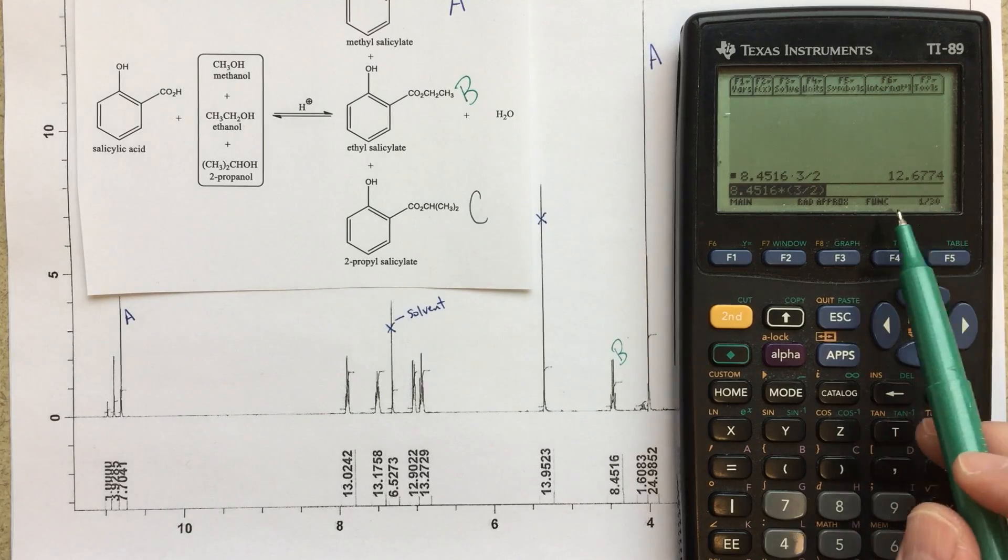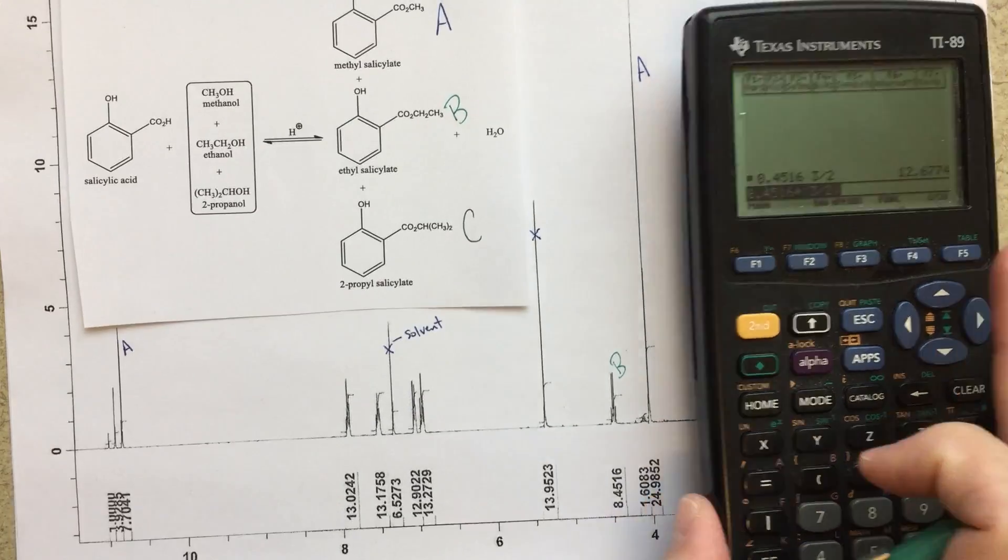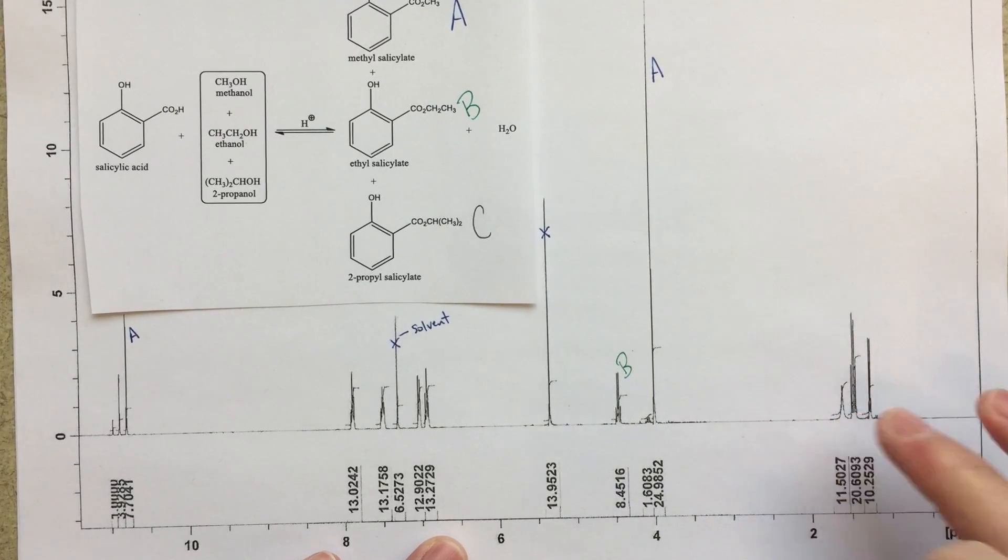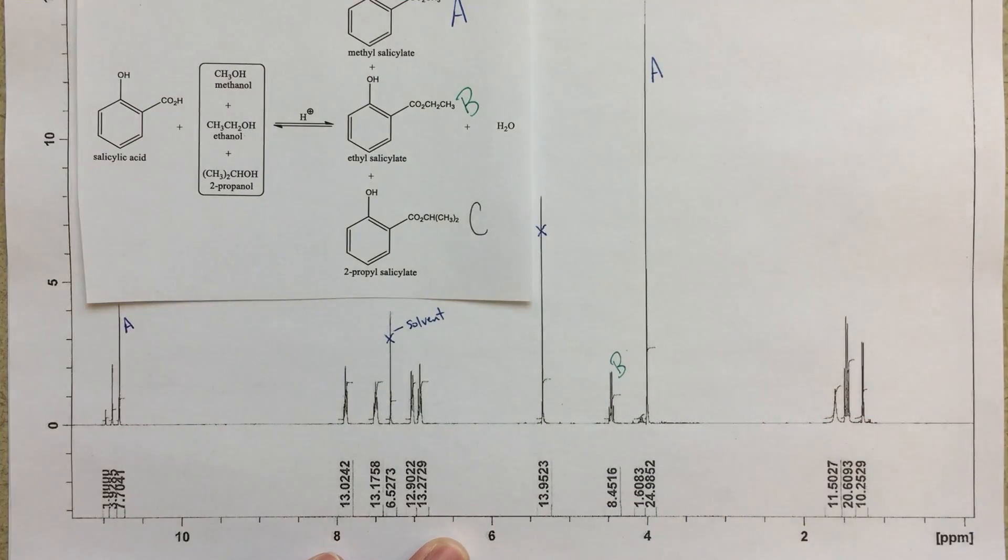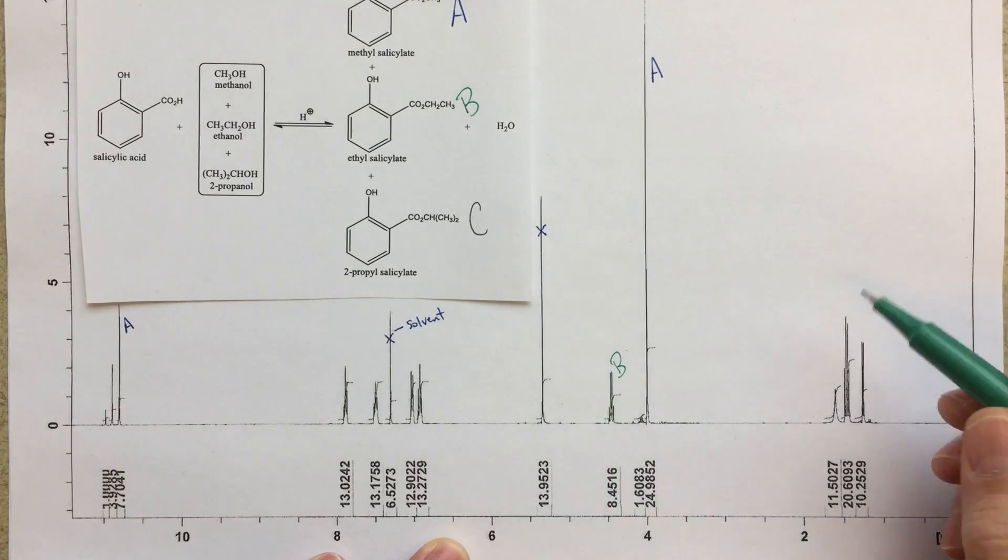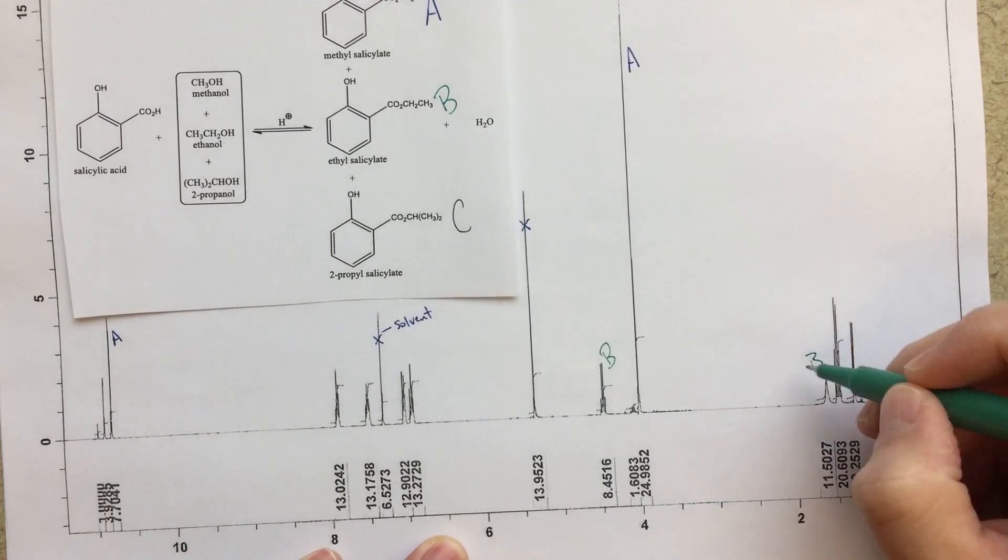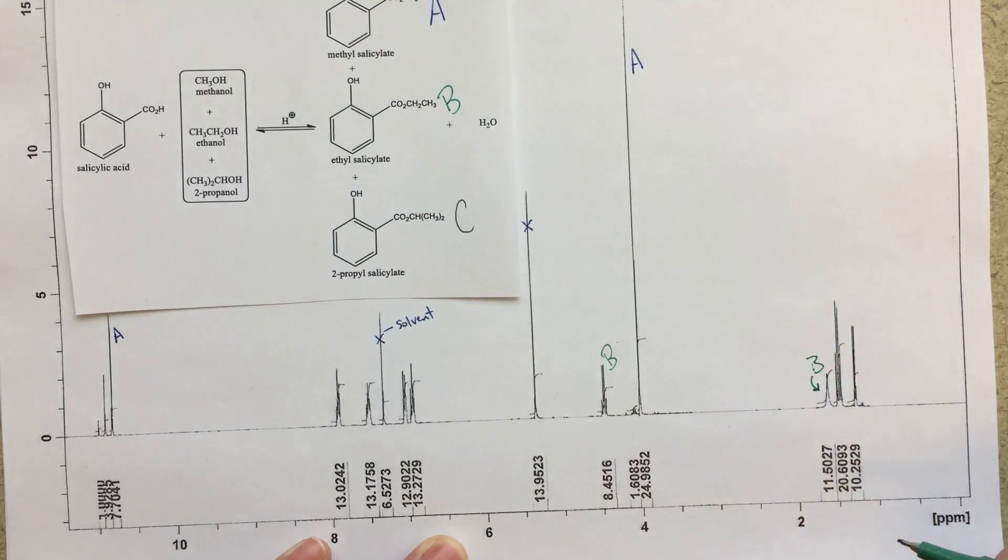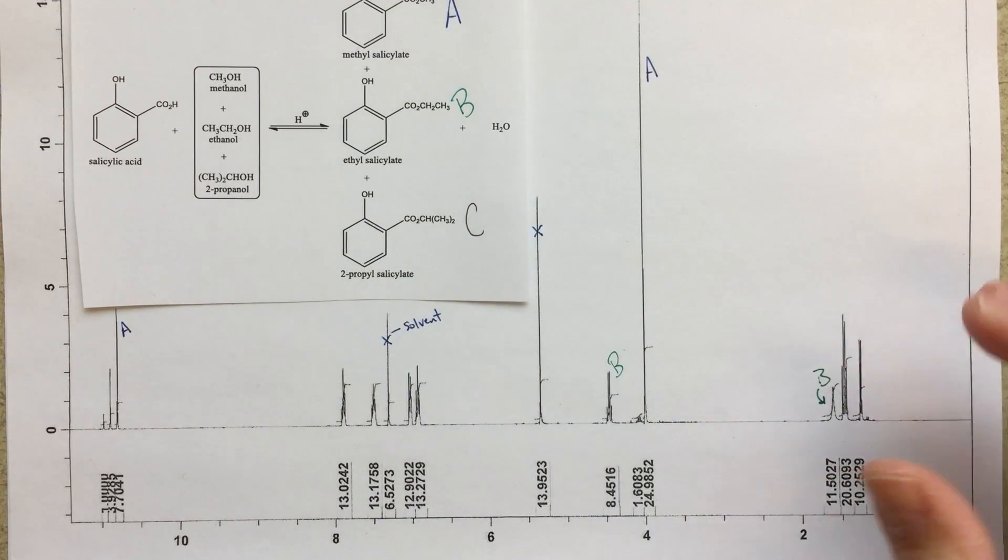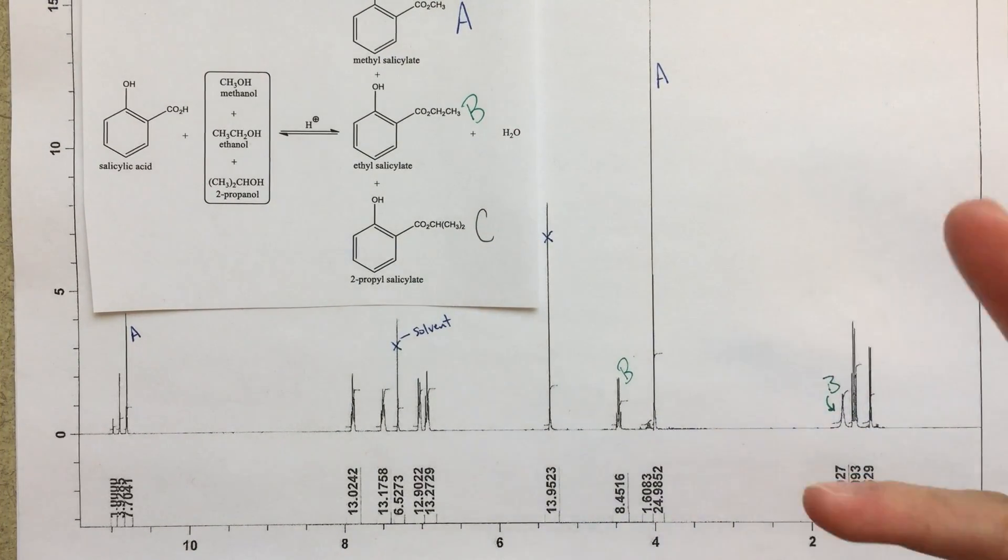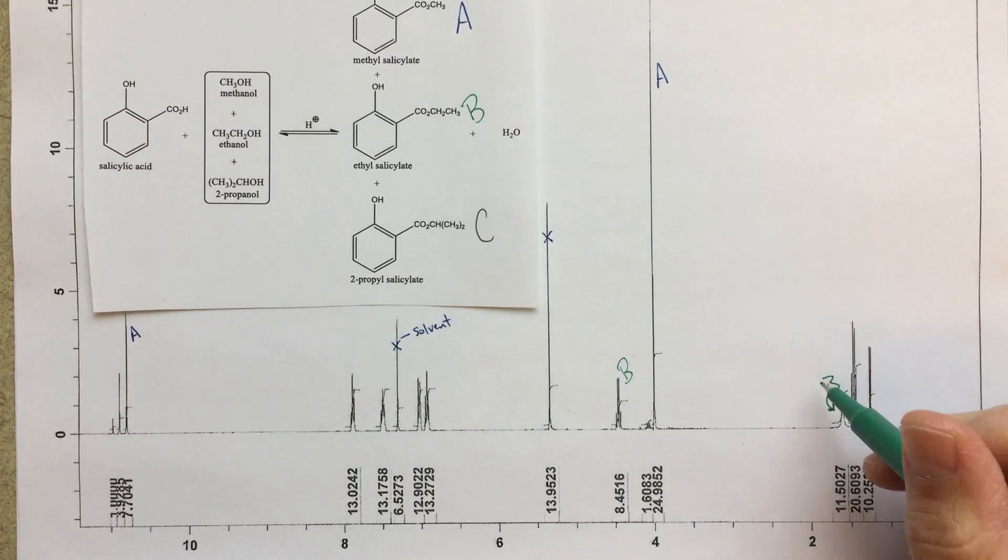Because whatever this value is, that should really be what the integration for our methyl group is. Now, the number we get, 12.6774, is definitely closer to this 11.5027 than 20.6093. These integrations are not going to be exact. But I think it's safe to say that this broad peak is probably that triplet and just the coupling did not get drawn out as nicely as we'd like to see. But I think we can safely say that this B peak, that's going to be our ethyl peak.